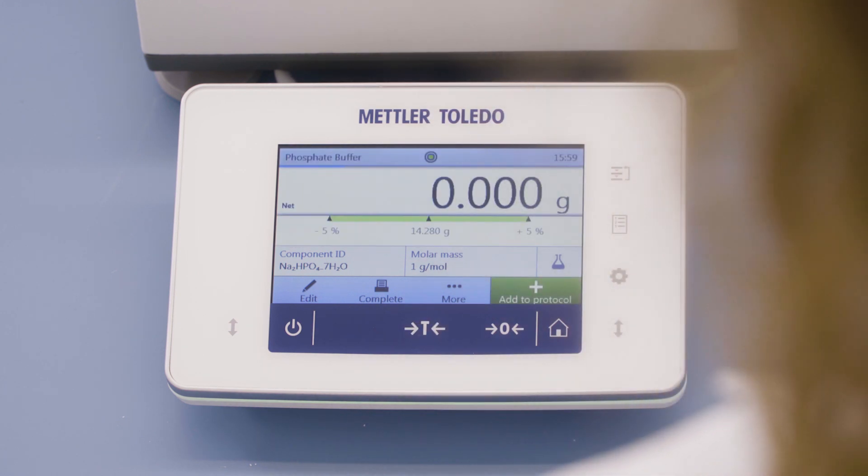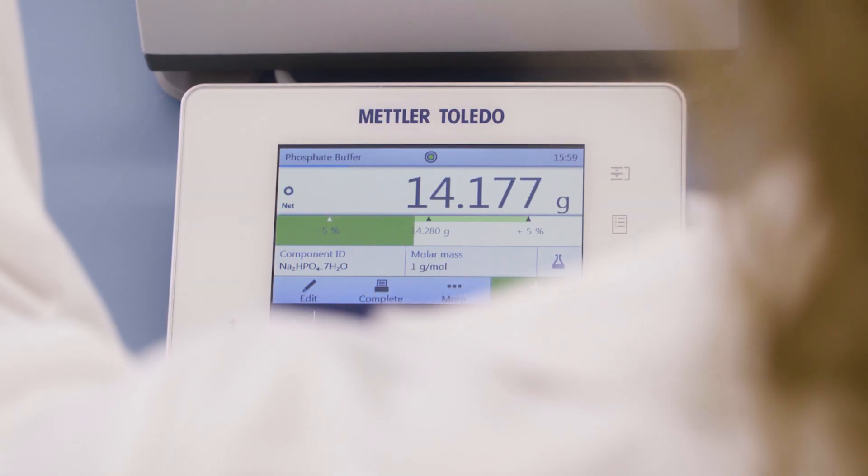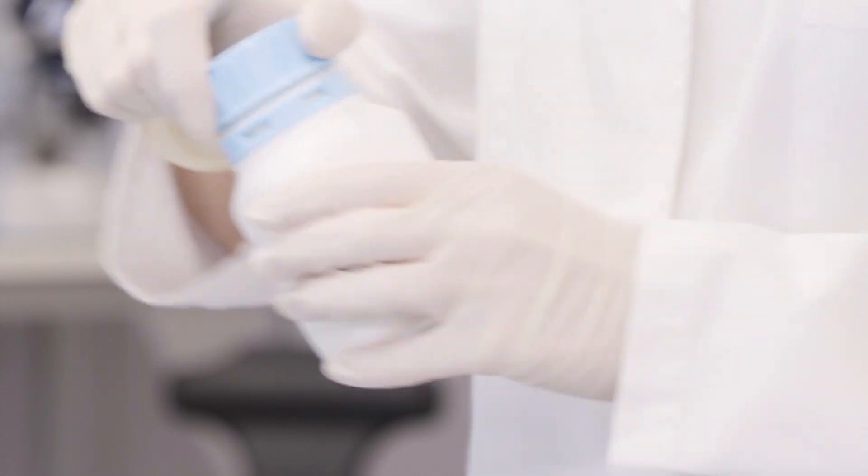The balance software guides you through the addition of each ingredient. The SmartTrack weighing guide makes it easy to weigh in each ingredient within the predefined tolerances.